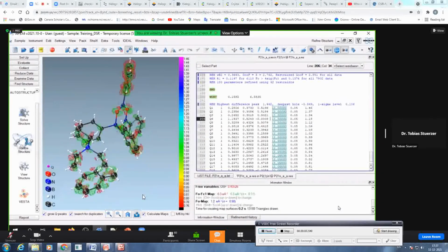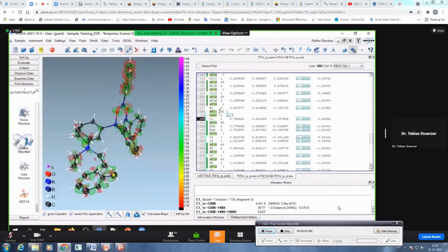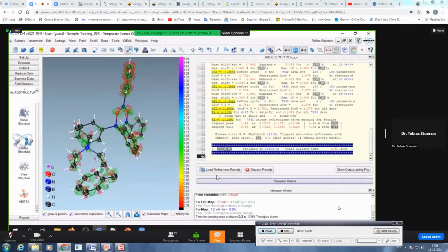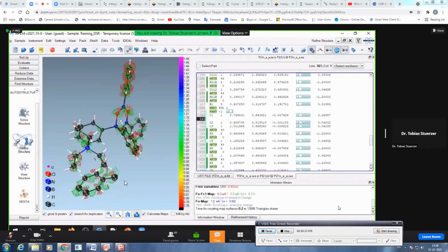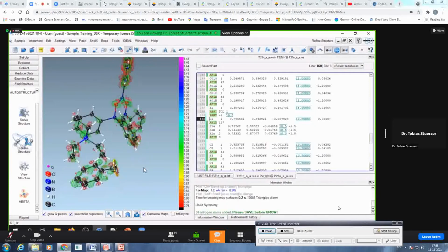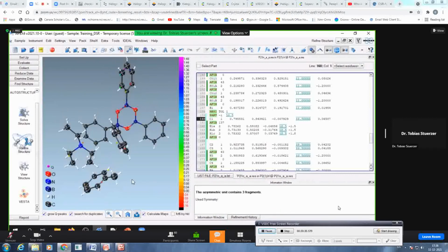You have to check whether that's all done properly. This is of course not right. This is a 137. Christian has a nice tool to add that one. Right click. Add this ordered. Add ordered. This one.